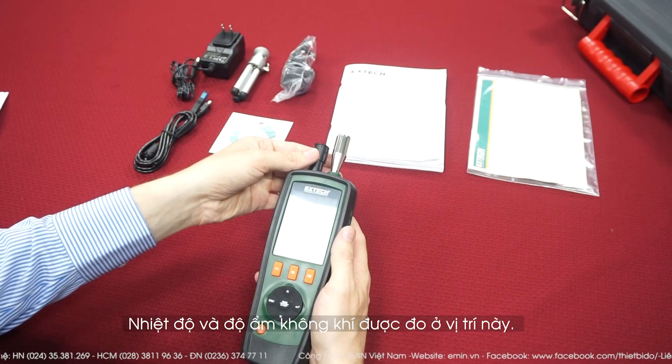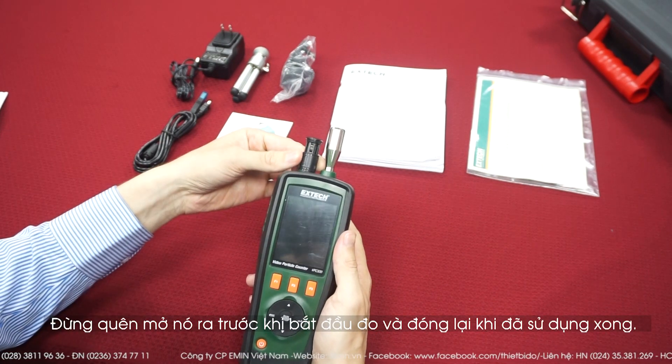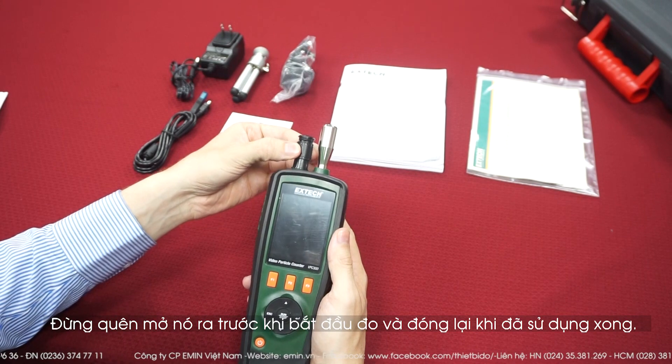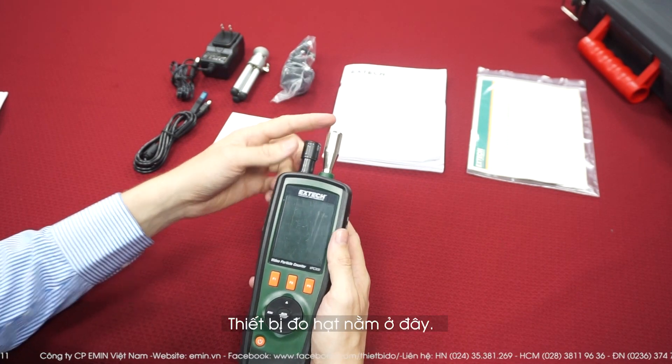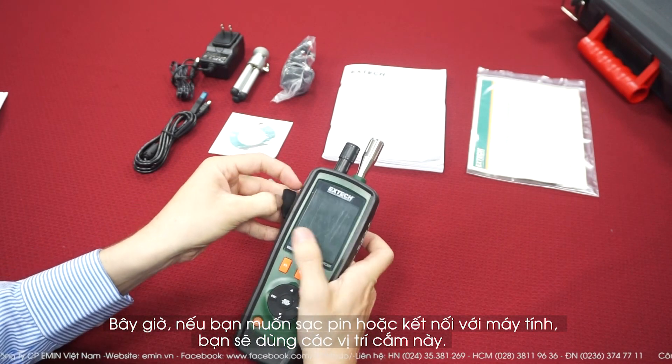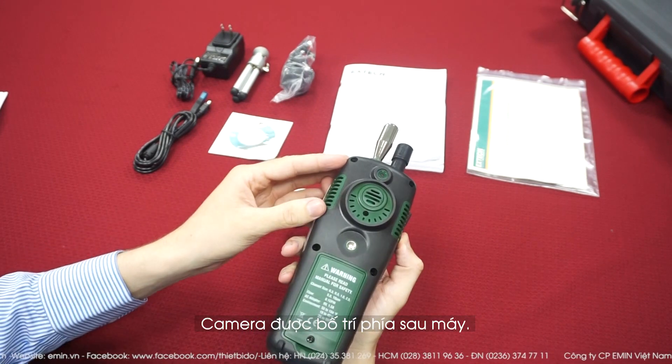The humidity and air temperature sensor is here. Don't forget to open it before you measure and to close it afterward to protect it. The particle counter is here. If you want to recharge or connect it to the computer, you have the port here. And the camera is behind.